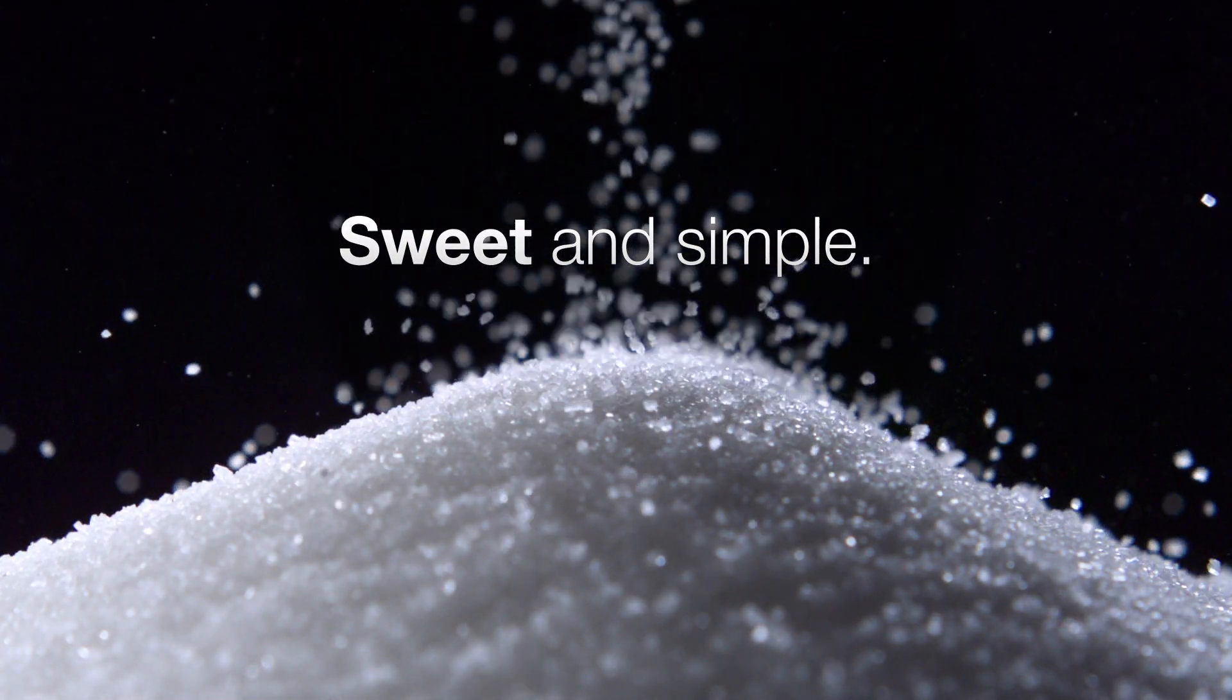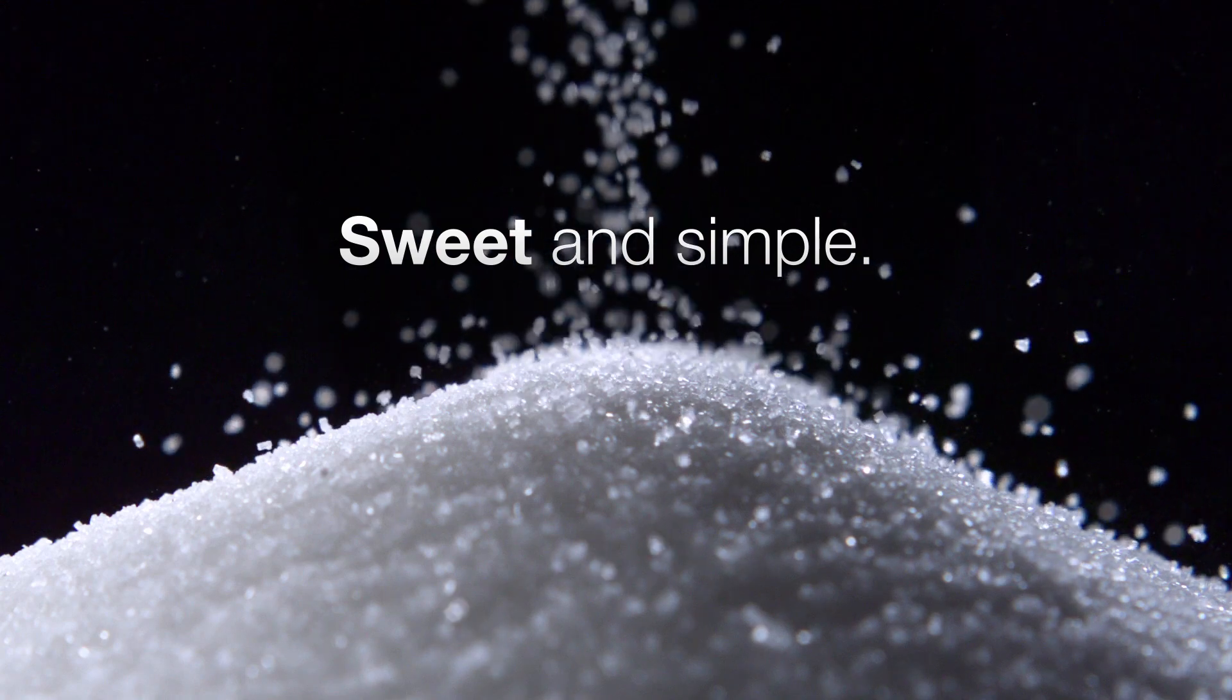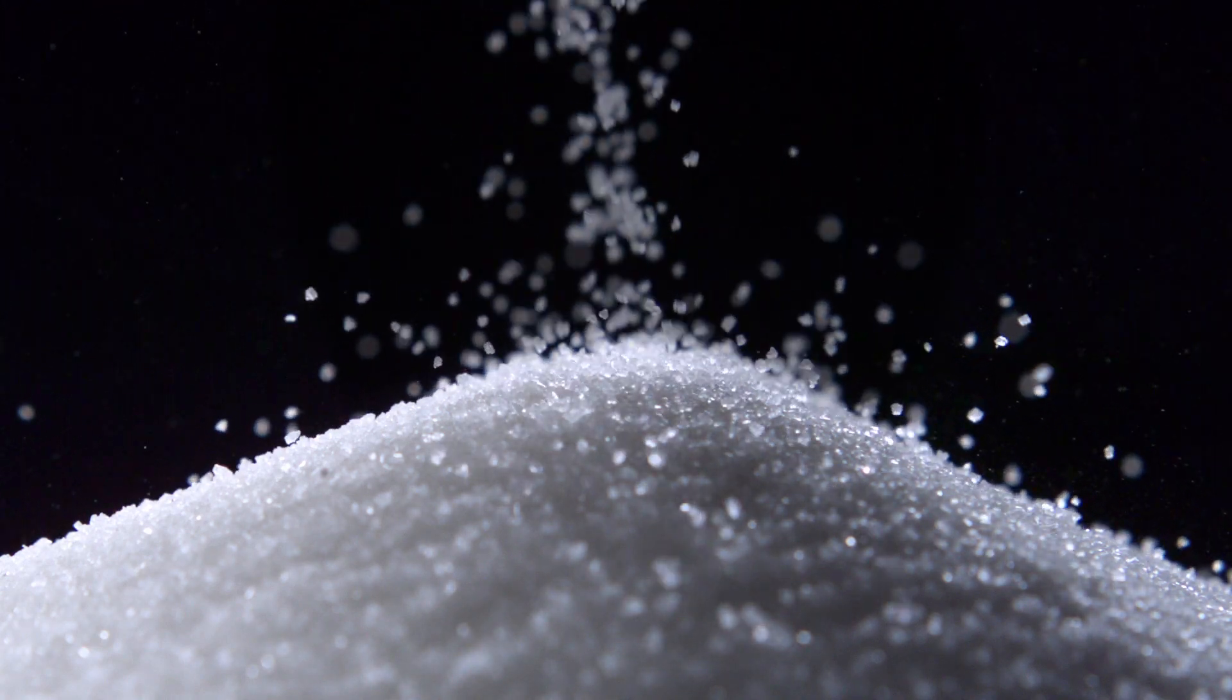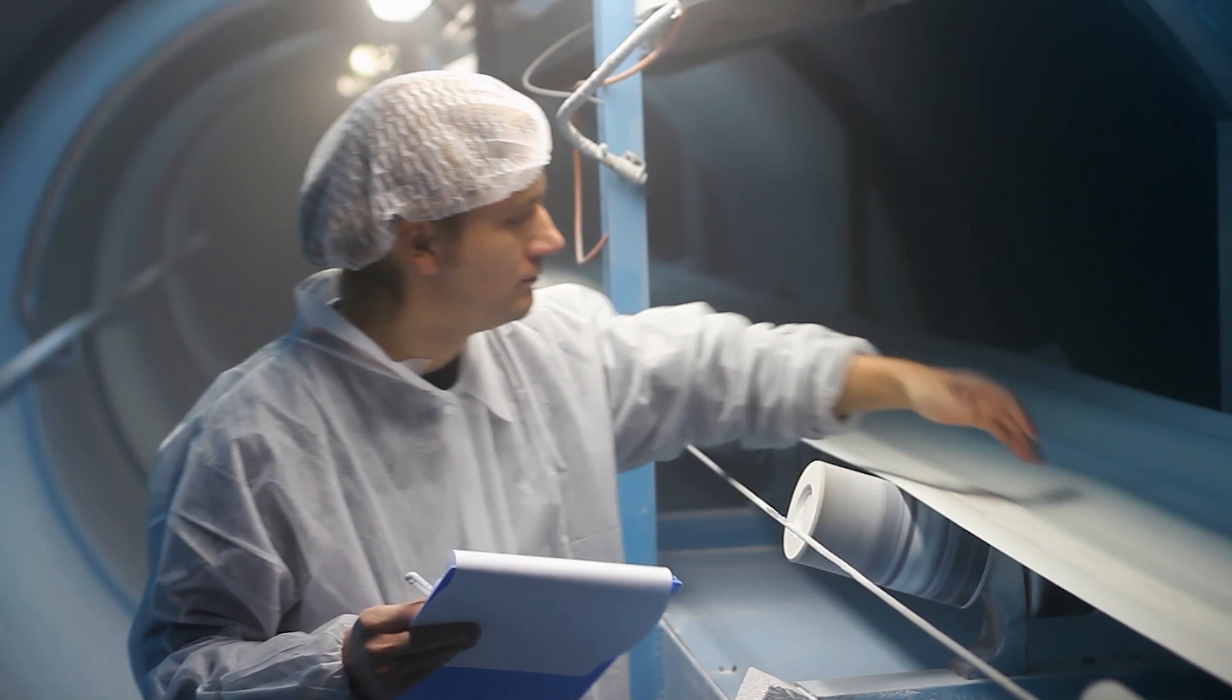Sweet and simple. A super smooth process flow from A to Z. Your sugar production optimized with our instruments.